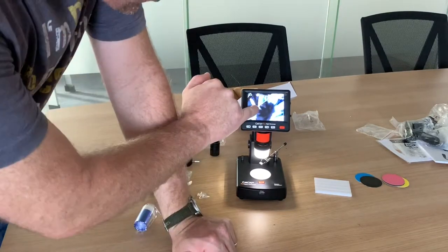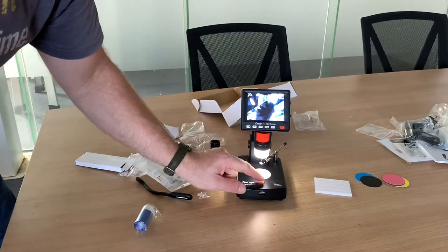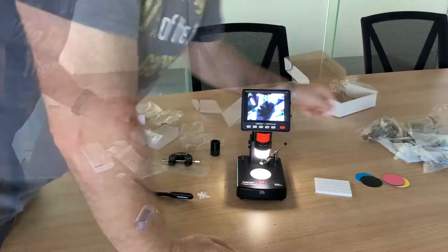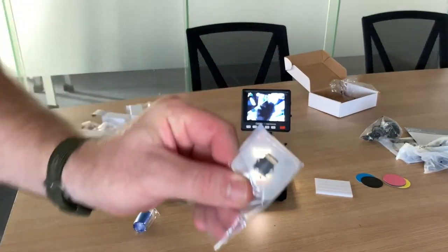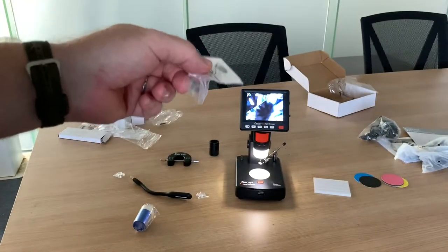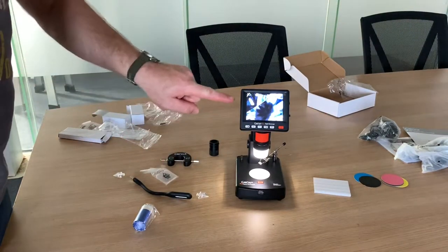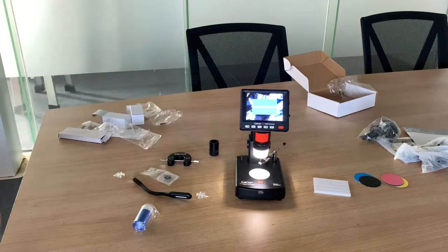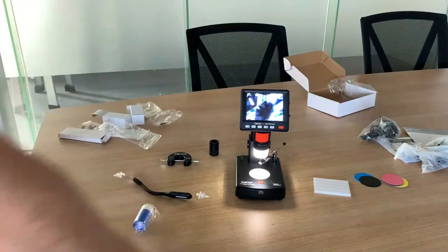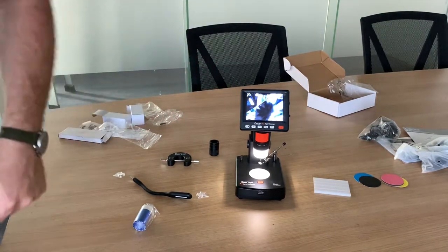You can see the cuts here - they're rough because it's just a really rough cut. If you put the SD card in - it comes with an 8 gigabyte SD card - this can take a video of what you're viewing, or you can pop the SD card in the side and press to take a photo. It says 'please insert SD' - I'm not going to use it because it's a new product, but it'll take a photo. You can also plug it into a computer screen.